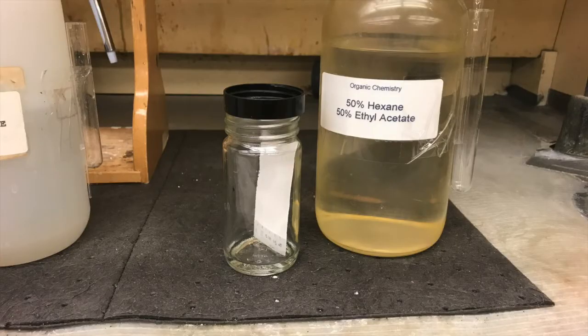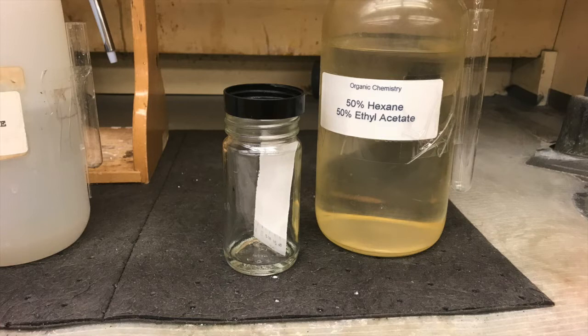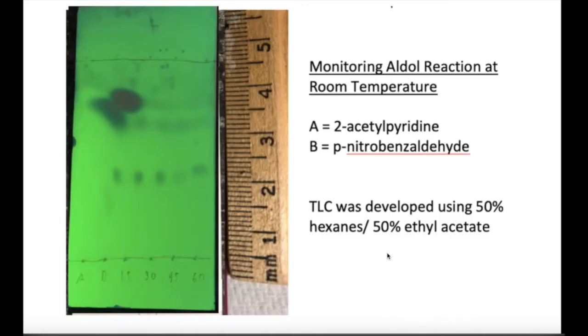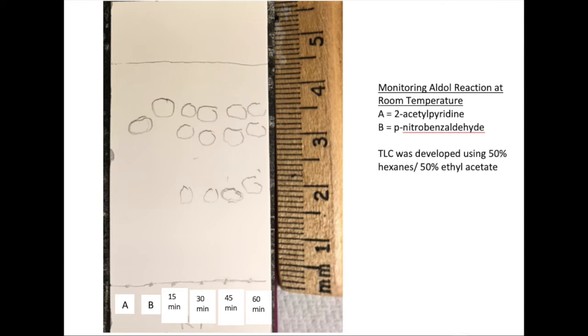The TLC analysis for this was done exactly the same as it was for the last reaction. Every 15 minutes we took a little bit of the reaction mixture and spotted it on the TLC plate. Here's what that TLC plate looked like. Unfortunately, it looks like some of the spots started to merge. Here's our 2-acetylpyridine, which should be a little bit more to the left here. And then our p-nitrobenzaldehyde, this big spot at the top, should be a little more to the left as well. And here's our 15 minute, 30 minute, 45 minute, and then 60 minute lanes. To make it easier, we also just circle the spots on the next slide. So you guys can use this to calculate any RF values. That way there's less confusion.